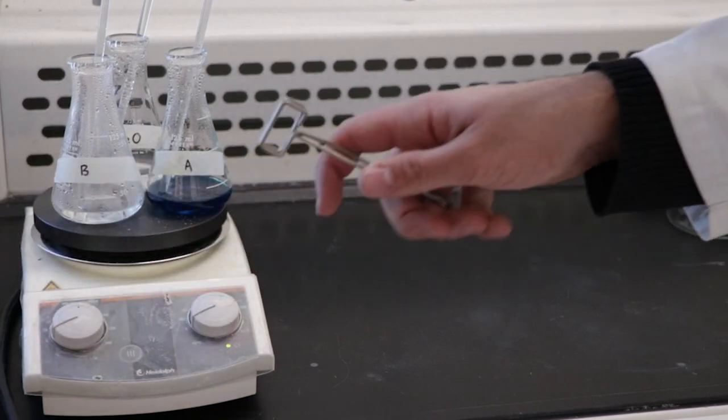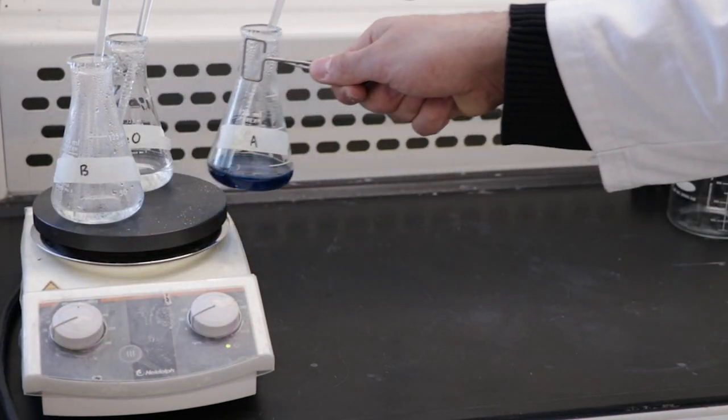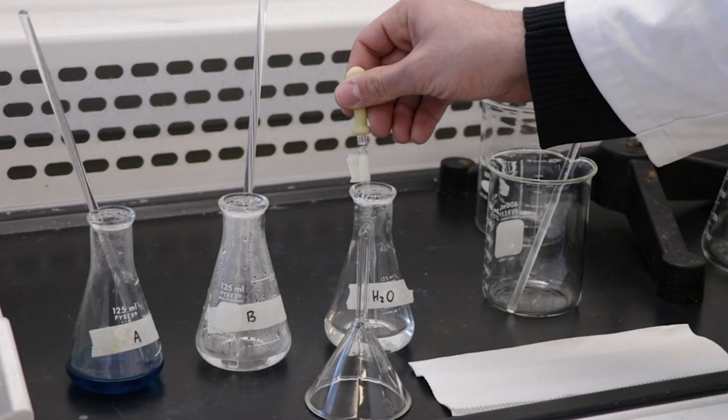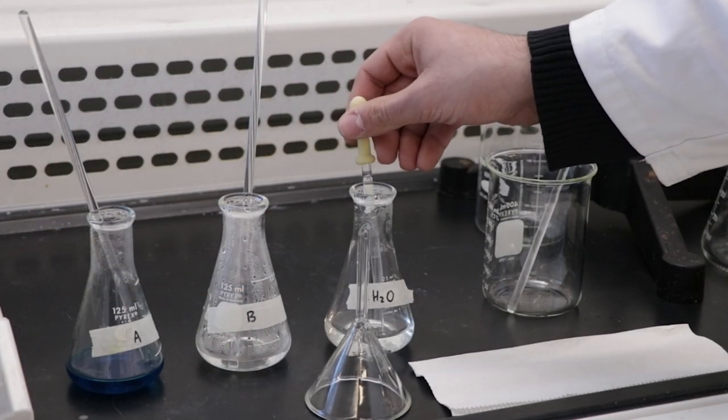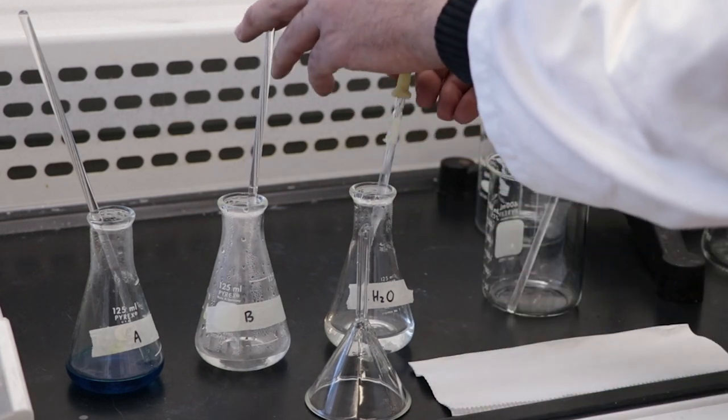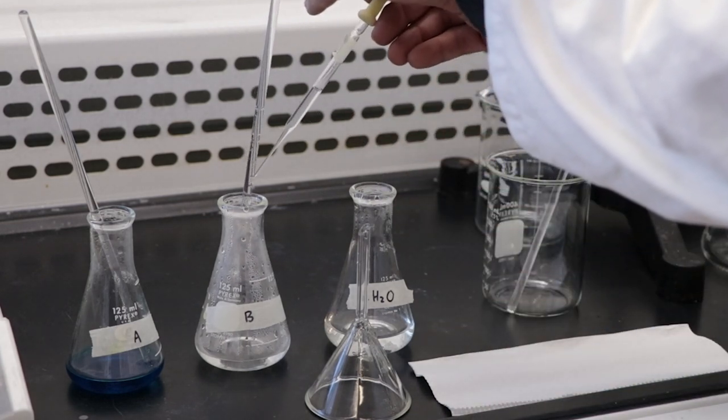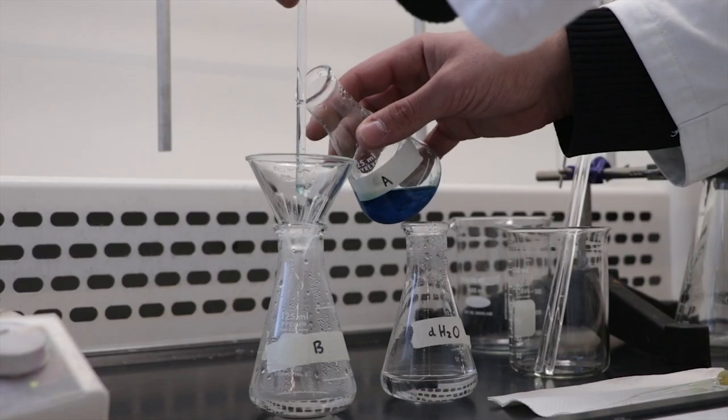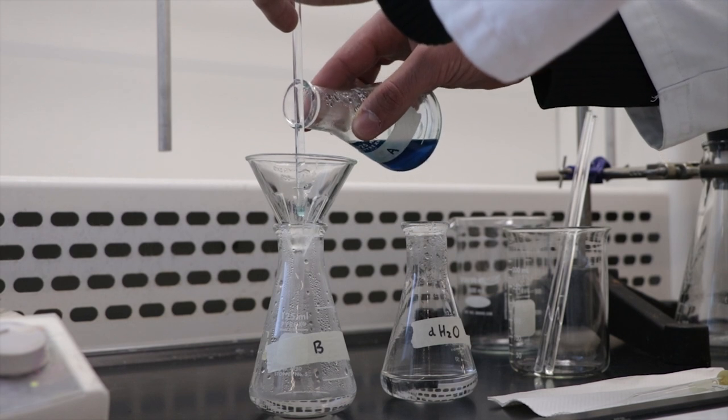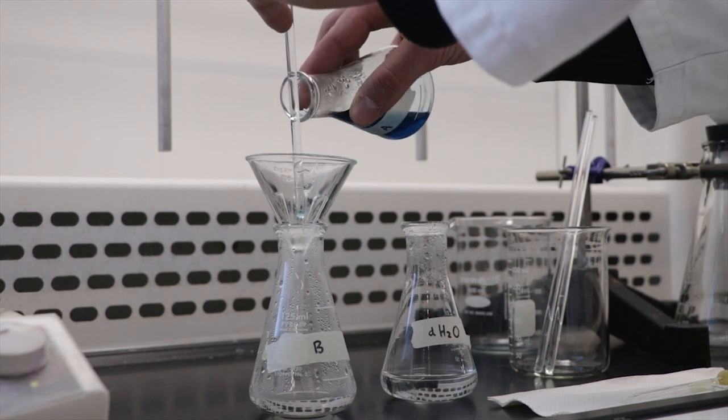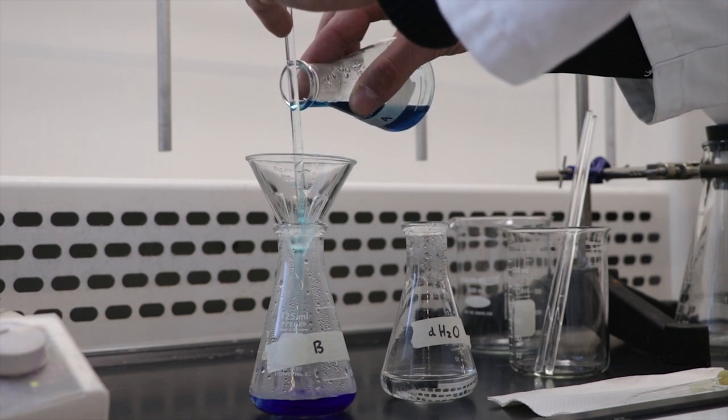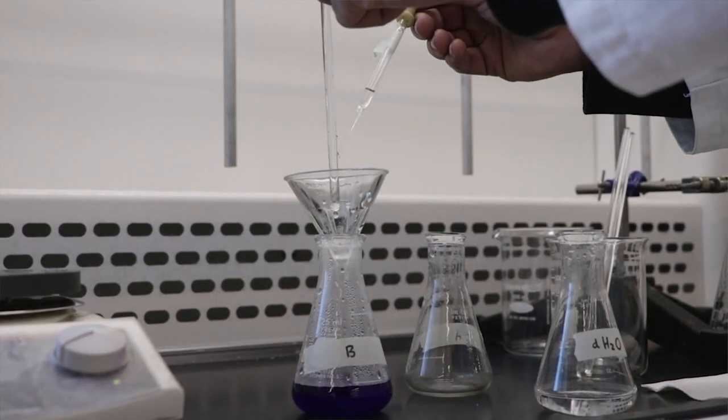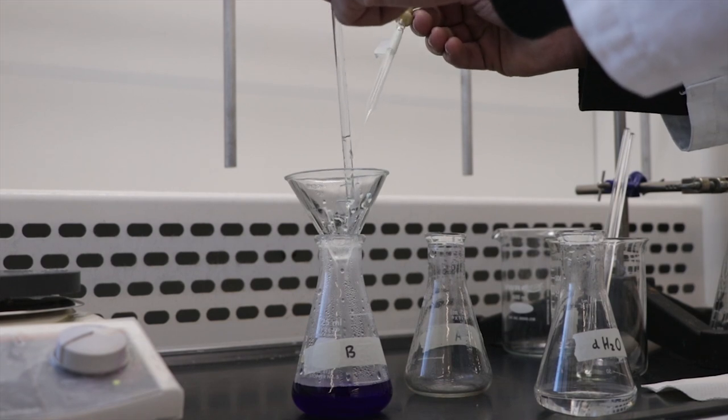Once they have dissolved, remove the flasks from the hot plate. While the solutions are still warm, quantitatively transfer the contents of flask A into flask B. Before removing the glass rod from flask B, rinse it into the flask to ensure that no reactants are lost. Use a minimum amount of warm distilled water to rinse out any remaining solution from flask A into flask B. Remember to rinse the glass rod from flask A and the funnel to ensure complete transfer.